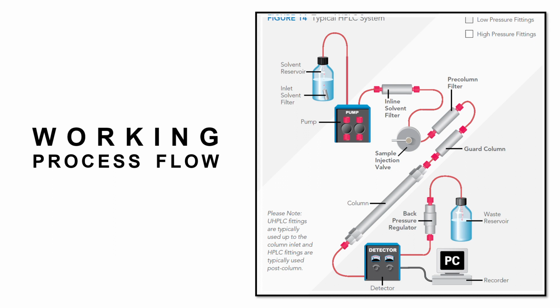Now we will see how we can read the chromatogram. The word chromatogram means a plot obtained via chromatography. The chromatogram is a two-dimensional plot with a vertical axis showing the concentration in terms of detector signal intensity and a horizontal axis representing the analysis time. Retention time is the time interval between the sample injection point and the apex of the peak. The time required for non-retained compounds to go from the injector to the detector is called the dead time.